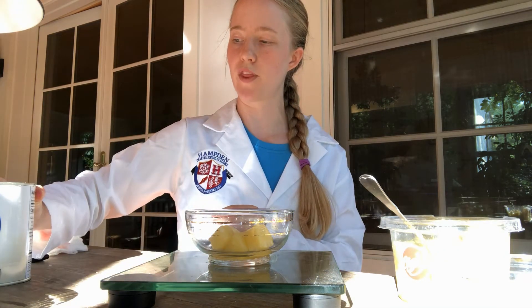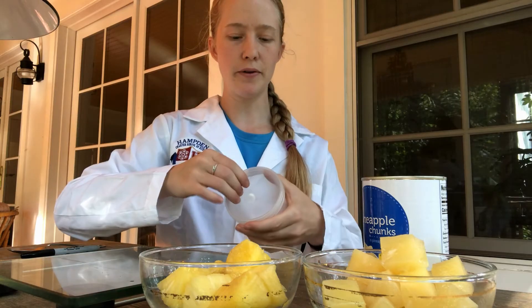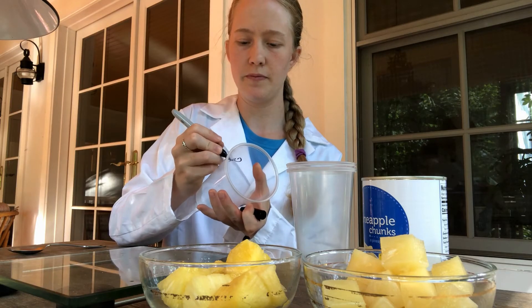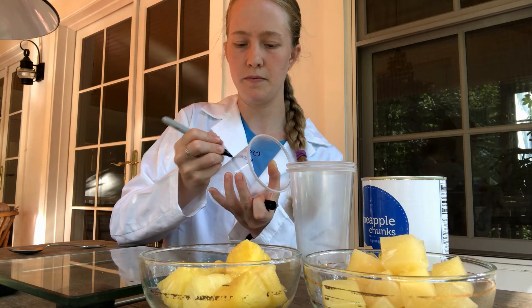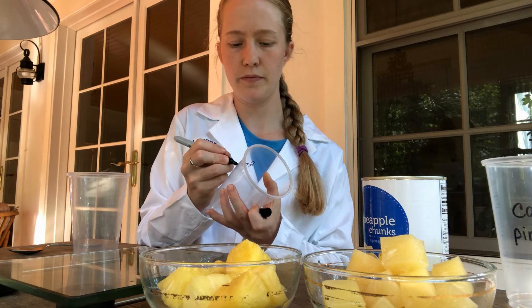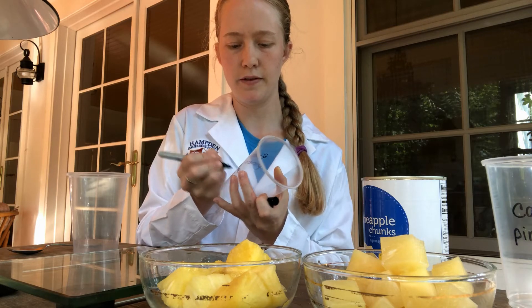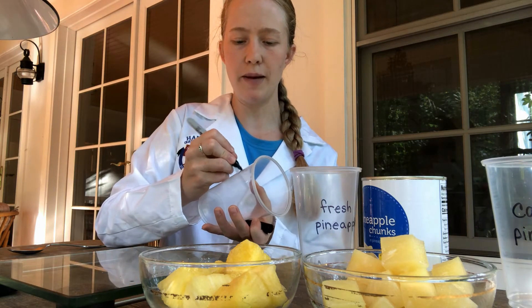That says 50.8 grams, so that's pretty close, and with the level of accuracy of this scale that might be about as close as we can get. I'm going to label my cups — this will be for my canned pineapple, and this cup will be for my fresh pineapple. And I have a third cup here; this one is going to be my control, so this is no pineapple at all.